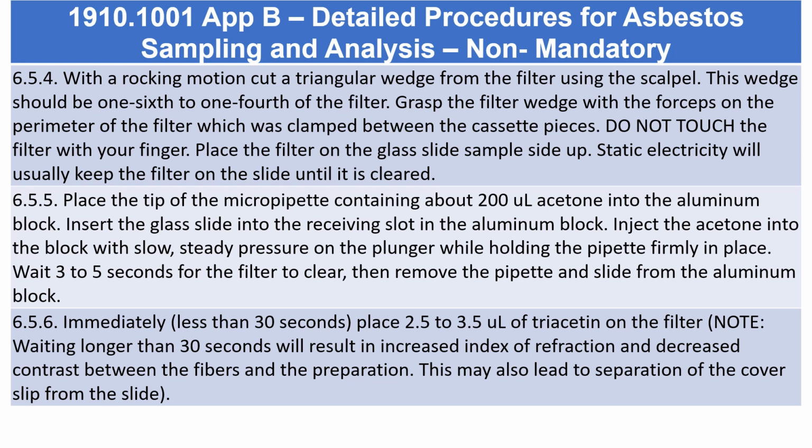6.5.6. Immediately, less than 30 seconds, place 2.5 to 3.5 µL of triacetin on the filter. Note, waiting longer than 30 seconds will result in increased index of refraction and decreased contrast between the fibers and the preparation. This may also lead to separation of the cover slip from the slide.